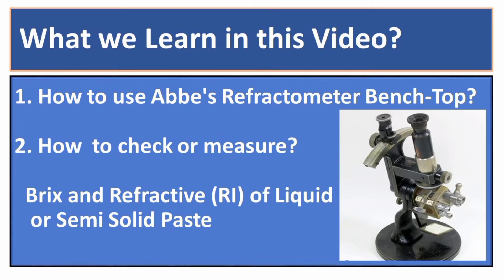So there are two objectives of this video: one is the use of the device, and the second one is to learn how to measure brix and refractive index of any liquid.